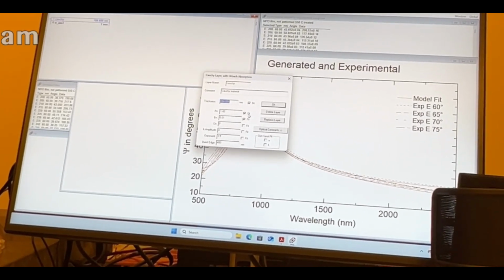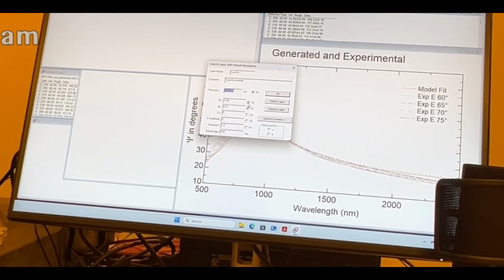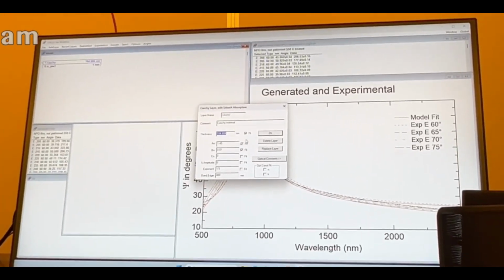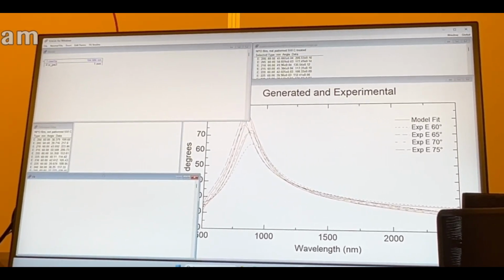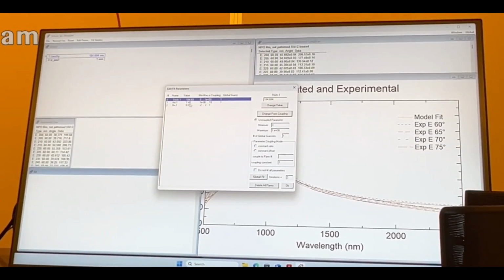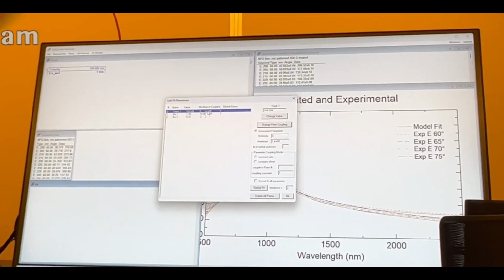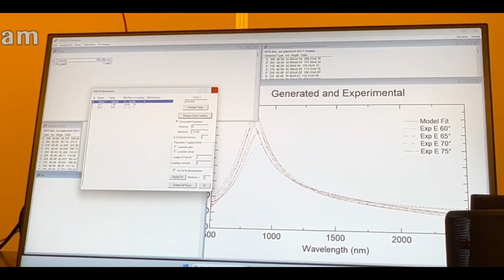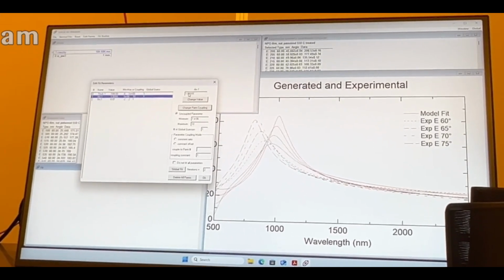Now I could allow it to try to adjust the A and B term if I want, but I can also mouse roll those. It's just an extra step to get to that location, so I'm going to show you where that is. You need to have it on as an active fit parameter, like I do. And once it's an active fit parameter, you can come down to your fit section here, and basically say edit params. So in the edit params window, I've got my active fit parameters here. You can set up things like global fitting. That's going to do some searching for parameters, a wide range search, stuff like that. Or the main trick here is I can come in here and go to the A parameter, and now I can adjust it here. So if I mouse roll it here, that adjusts the A.